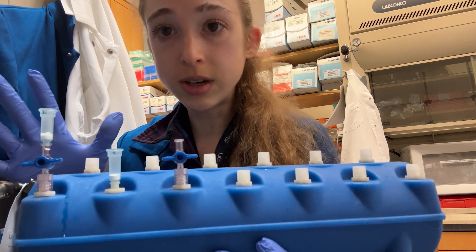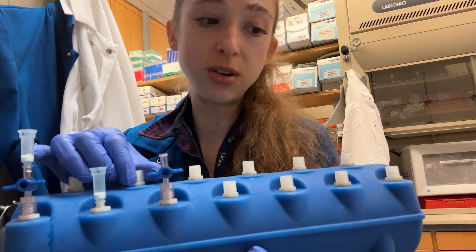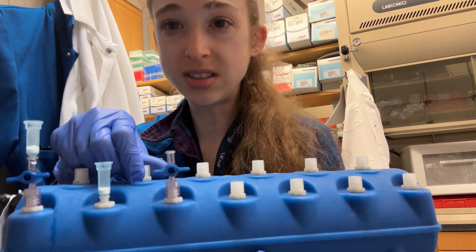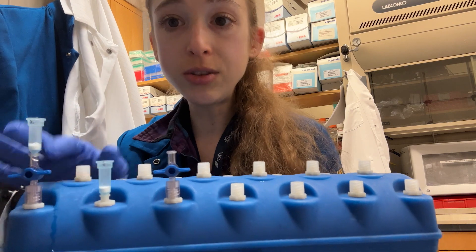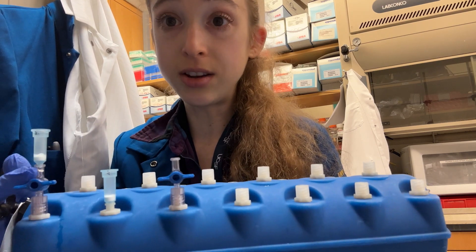Stoppers tend to work a little better than having just a stopcock in the off position, but do what works for you — whatever is simplest. Keeping the stoppers in there is also helpful so you don't lose them. You need to make sure that all these holes are covered and tightly sealed, or else you're not going to get a good vacuum forming.